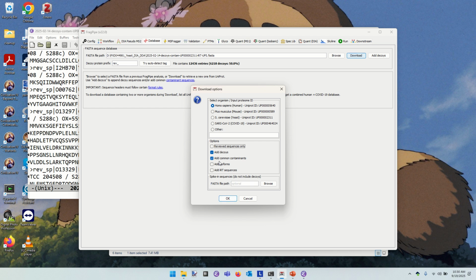So I don't think we do. Does anyone on our site use IRT routinely for experiments? Not the core facility, not you guys. So it's not so popular here, perhaps, but yeah.